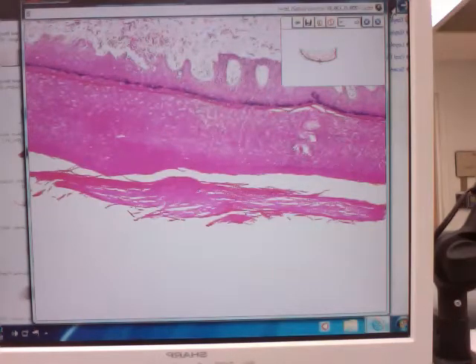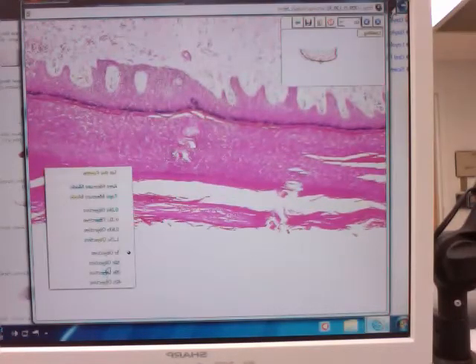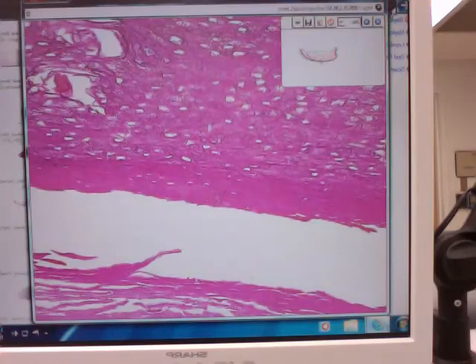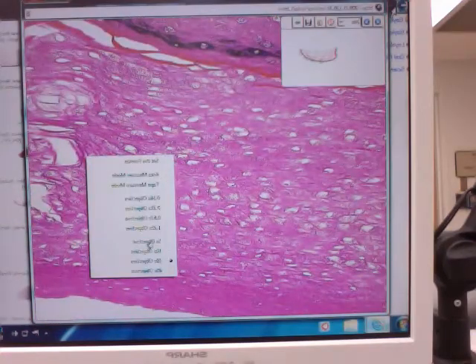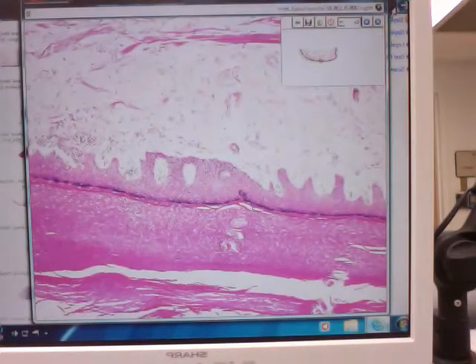Okay. Here's a tissue. Here's an epithelium. You got a free surface. Here's this big, thick layer, so it's more than one cell layer thick. You see all this stuff getting shredded off the outer surface. When we magnify it up, we can see it's no nuclei, dead squames of cells, no nuclei even in this layer. You gotta get all the way down here before you see nuclei again, really. So this is going to be stratified squamous, keratinized epithelium.